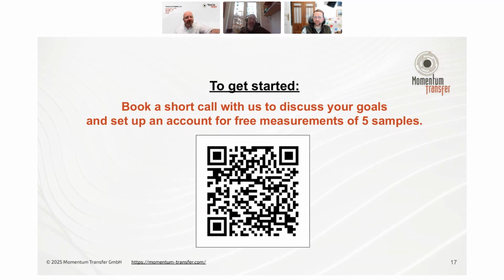We actually did recently have a case like that, and we had to load the samples in a slightly different way, which is also possible. The windows are made of Kapton, which is generally much more robust against all different kinds of solvents. And that's what we use to work with things that dissolve the sample holders, kind of internal Kapton vessels.